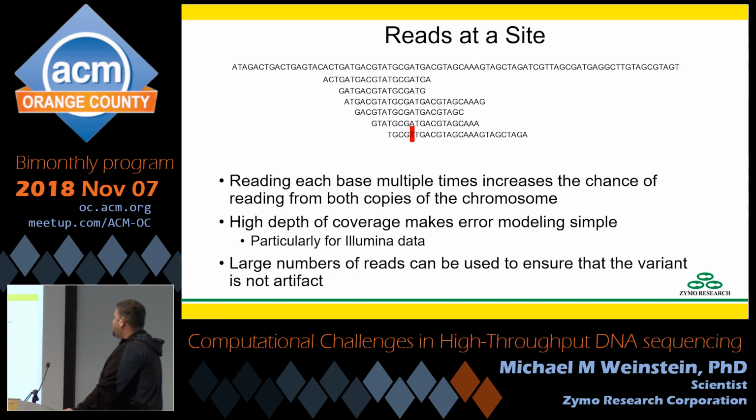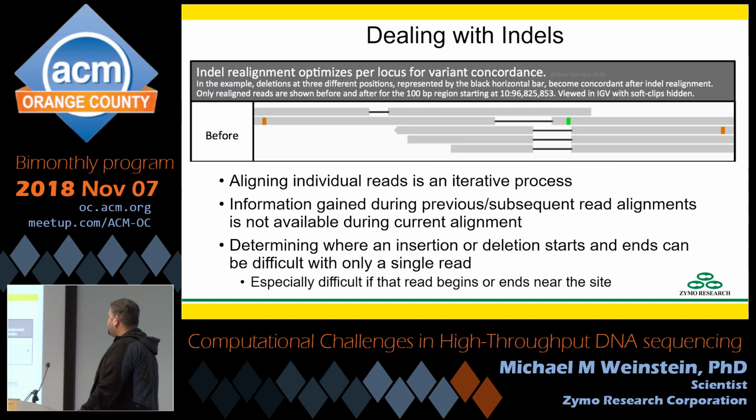So let's say, for example, here I have a read of a T where there should be an A. Is that a sequencer error? Quite possibly. Now let's say that at this site, half my reads are T when they should be A. Is this a sequencer error? No. This actually matches perfectly with the idea that this person got one copy with an A there, one copy with a T there. Is it clinically significant? I don't have enough context to know.